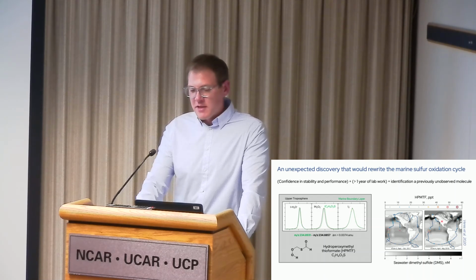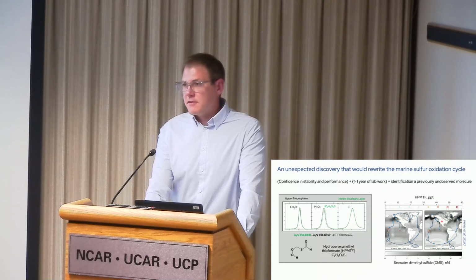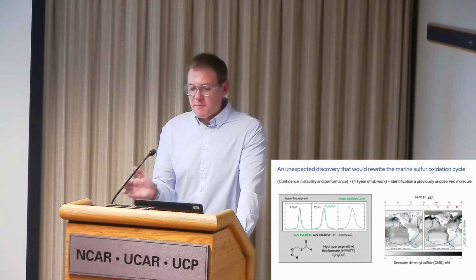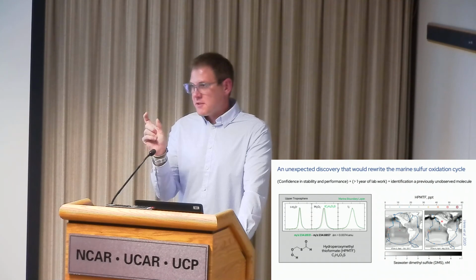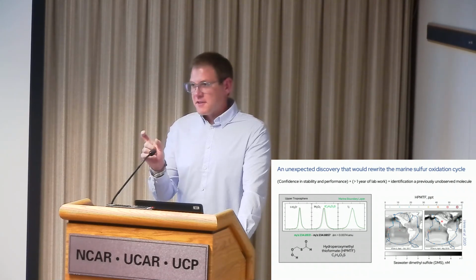But we got off the plane and I looked at the data, and it was subtle, but it was apparent within about an hour of the flight that there was something else there. It's low enough mass. Again, you have a mass, and what are the combinations of elements that can give you that exact mass? The lower that mass is, the easier it is to identify the exact combination. And so there were only a handful of things that could fit. And so I had a molecular formula within like 2 hours of being on the flight.